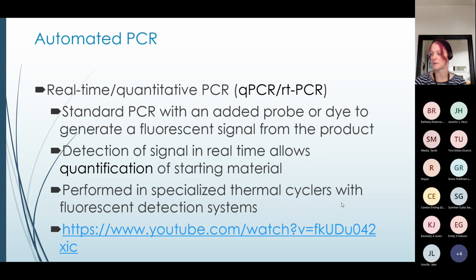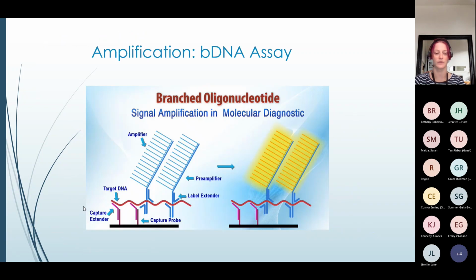Again, they're performed in specialized thermocyclers with fluorescent detection systems. There's another YouTube video. We're going to skip that for now, but we'll come back if we have time. There are lots of different PCR detection methods.